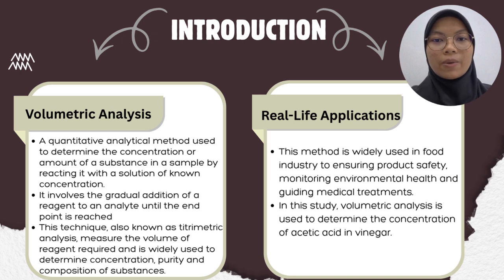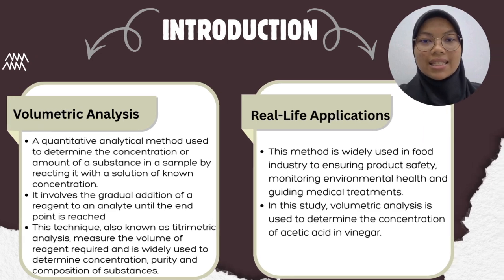In a real-life application, volumetric analysis is commonly applied in the food industry to ensure the product safety as well as monitoring environmental health and supporting medical treatments. For this study, the method is used to determine the concentration of acetic acid in vinegar.